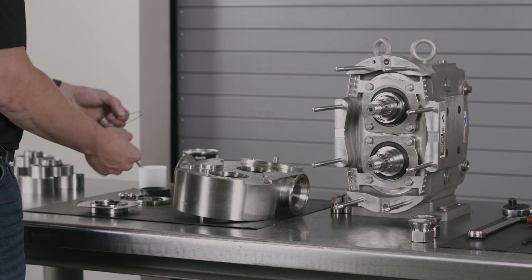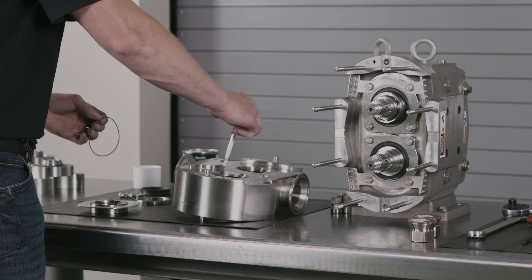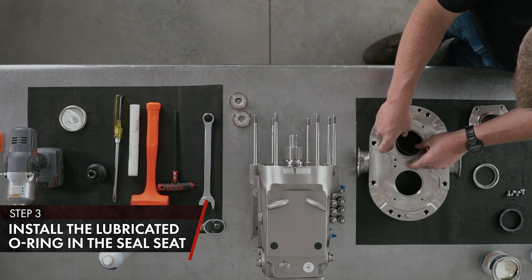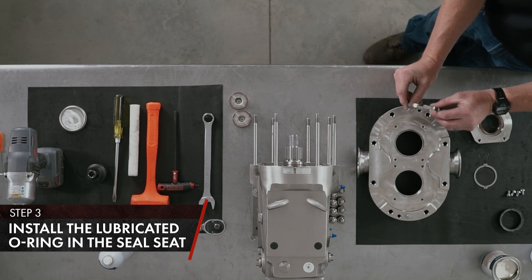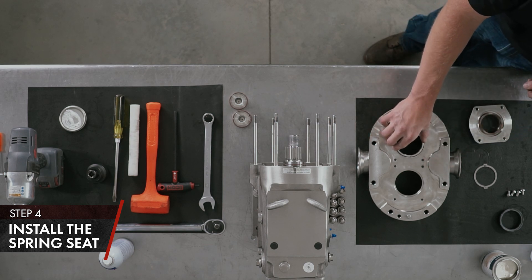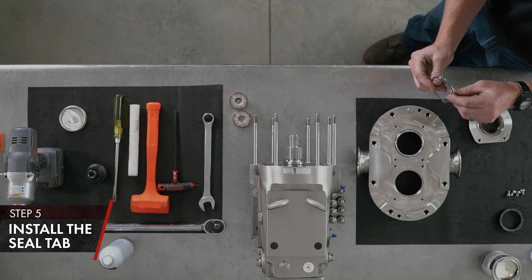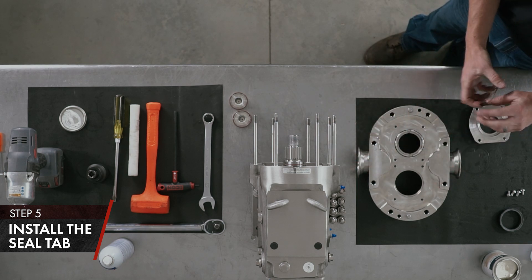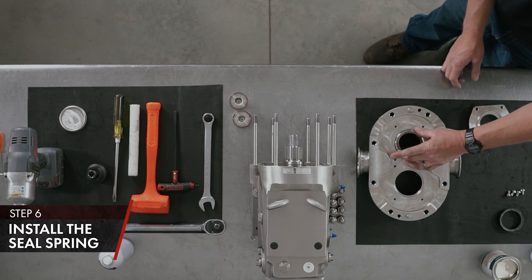Body seal components: you have your O-ring for your seal seat. Lubricate the body and the O-ring, and install. Install your spring seat with the tab holes facing up — make sure your O-ring is seated. Install your seal tab with the tabs facing down towards the product into the pump. Install the seal spring and make sure it's together — install on your seal tab.